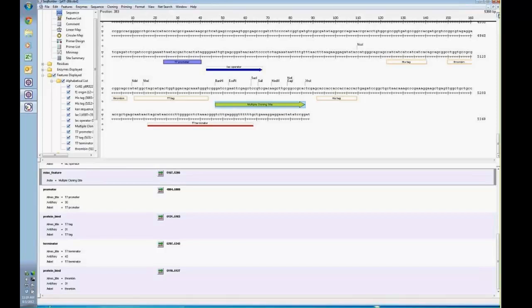So the next logical step, when looking at this vector, is making sure that, one, you choose some enzymes that can be readily and easily added to your target, and then also readily and easily inserted into this expression vector of interest. You could take a look at the open reading frame here if you wanted to turn that on.